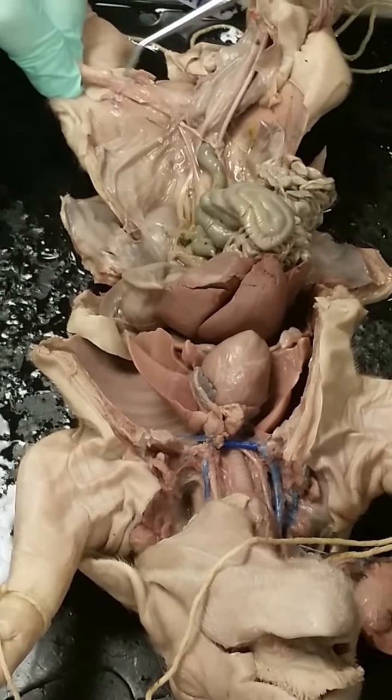Is that all right? This one has a better one. So here you can see the testis and you can see the epididymis right here. Again, inguinal canal would be right there, and this would be the vas deferens. Although, boy, this looks pretty bad, doesn't it? Doesn't look very good. Over dissected.